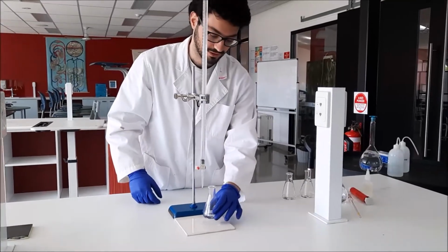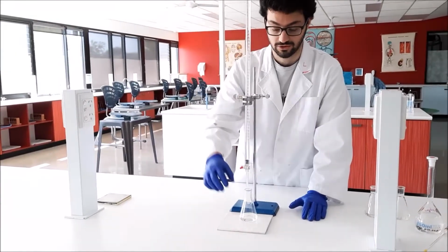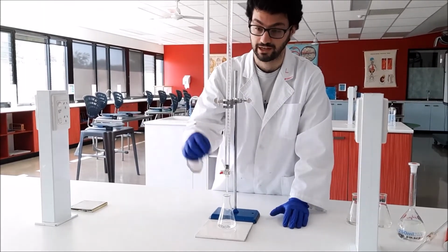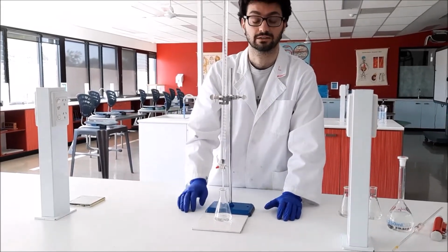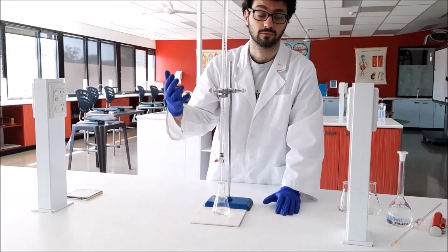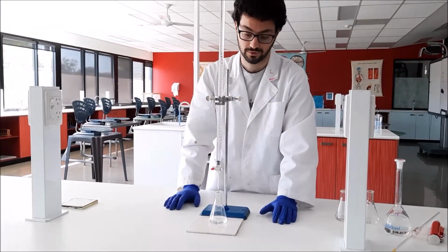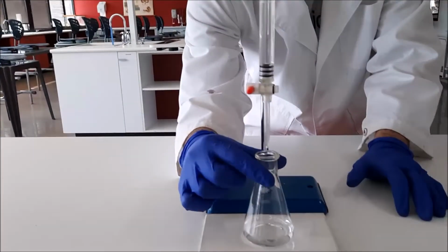So the aim for this is to titrate the sodium hydroxide in the burette into our conical flask. We're going to add our sodium hydroxide to it until we get this into a very light pink color. If we add too much, it will go really dark pink, and that's going to be overshooting it, so we don't want that much. So we want to add just the right amount just to see it start to change, because we're looking for that equivalence point.